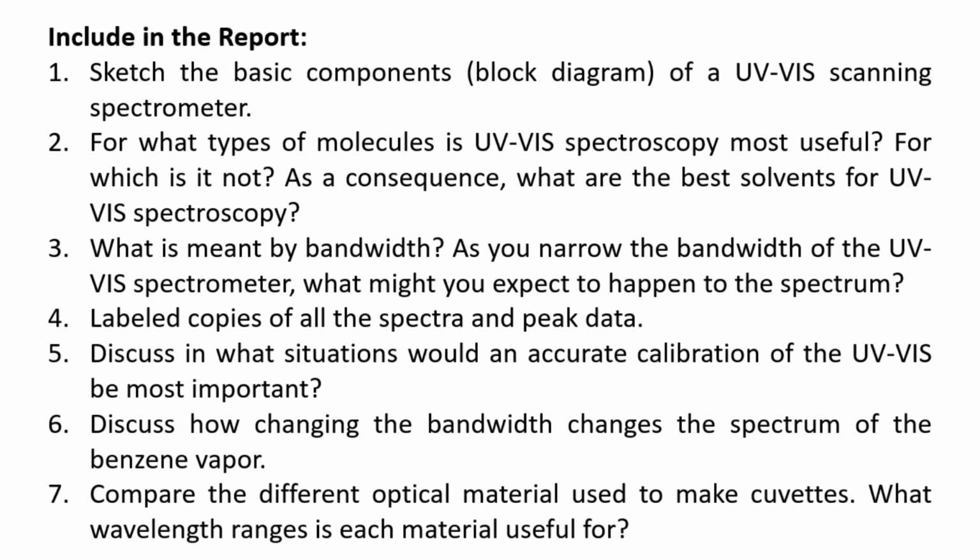Okay, so with that done, this is typically going to be done in the laboratory. Afterwards, in your report, you have to look at how to sketch the basic components of the UV scanning spectrometer. You should be able to know about the kind of molecules or compounds that absorb in this region, or that should be run under the UV spectrophotometer. You have to know about the bandwidth. You should be able to label copies of all spectra and peak data.